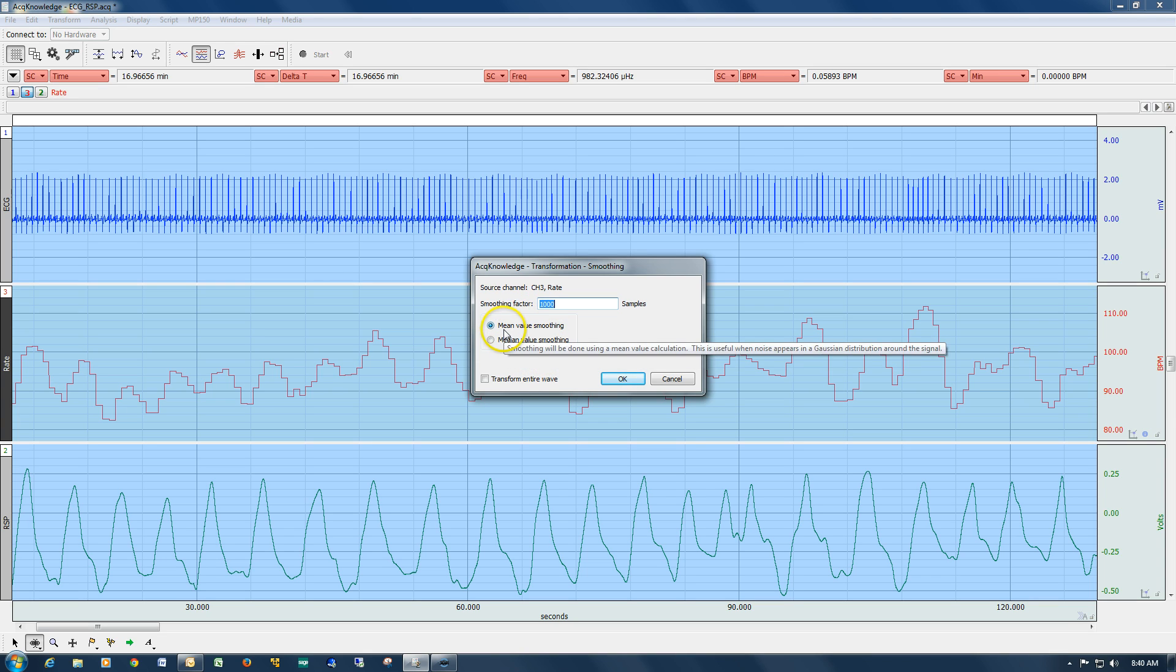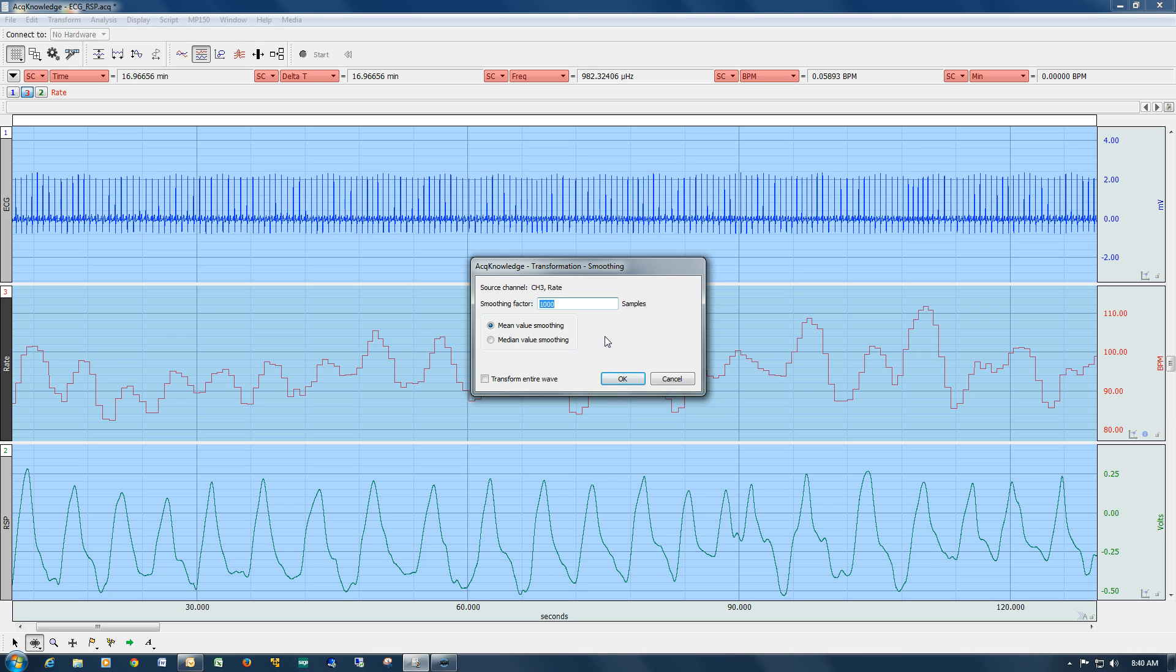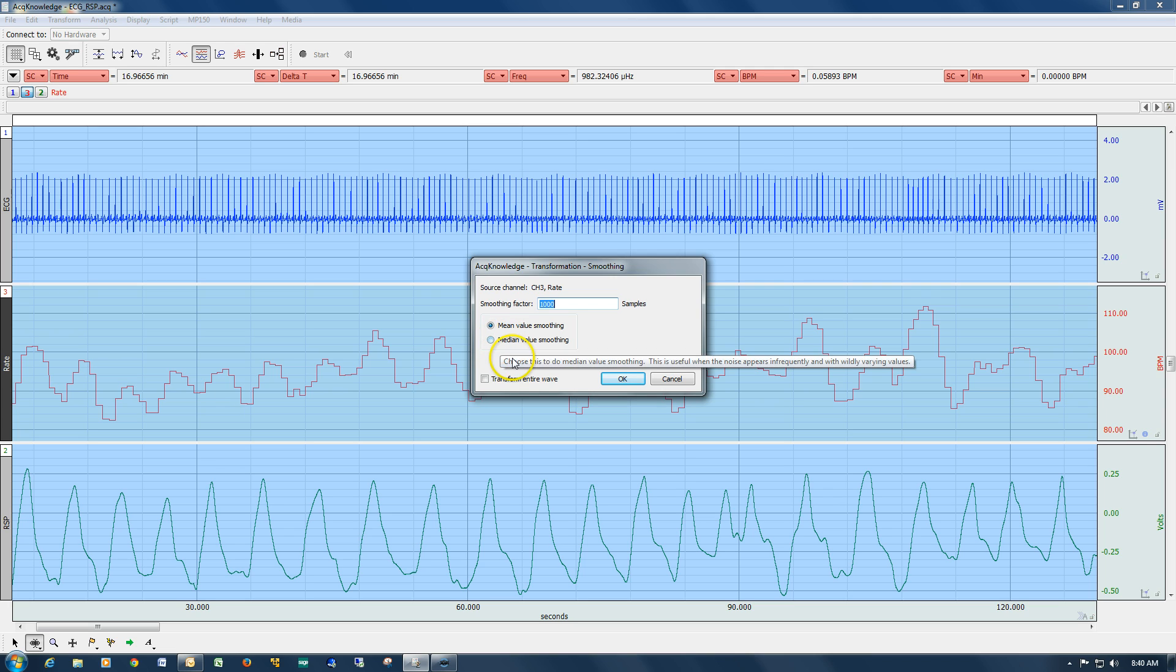There are two modes of behavior. One is mean smoothing, whereby as the moving average is running through the data, the mean value is used for the output of the average. Or alternatively, there's an option for median smoothing, whereby the median value is used instead of the mean.